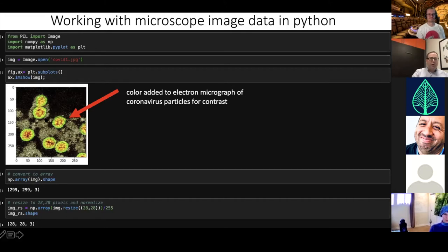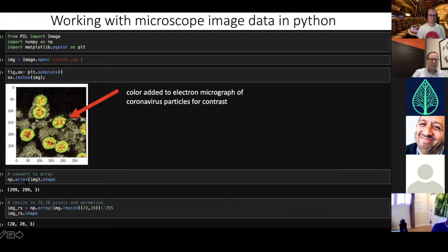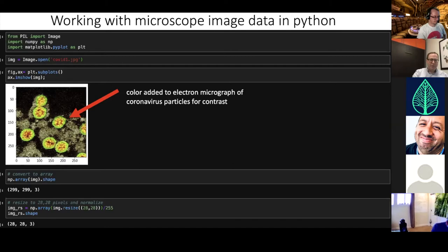When you work with images it's important to recognize that images are simply multi-dimensional arrays. If you're working with a color image, you have three channels — red, green, and blue. Here, converting this image into a NumPy array, you can see it's 299 by 299 pixels with 3 RGB channels. You can then do image manipulation — here reducing pixel size down to 28 by 28 and normalizing it.